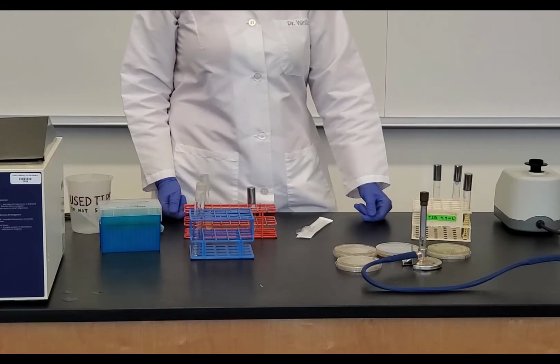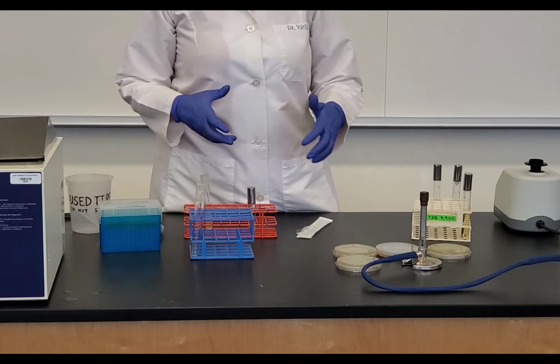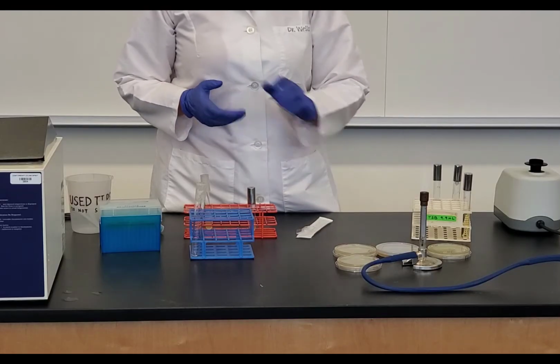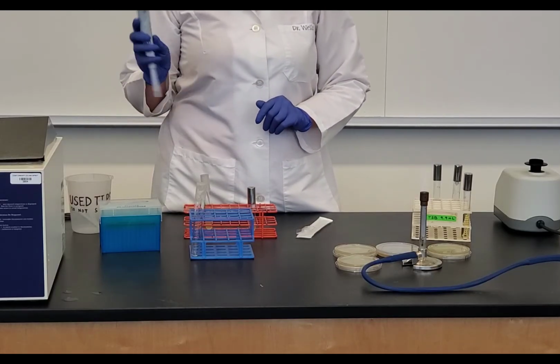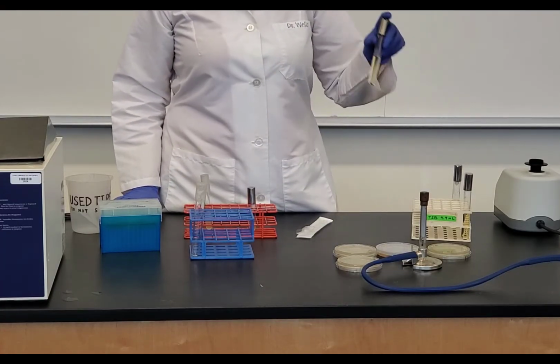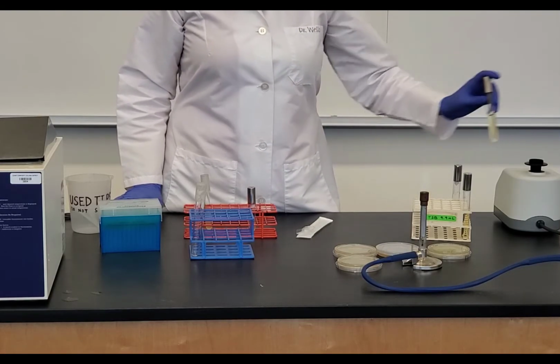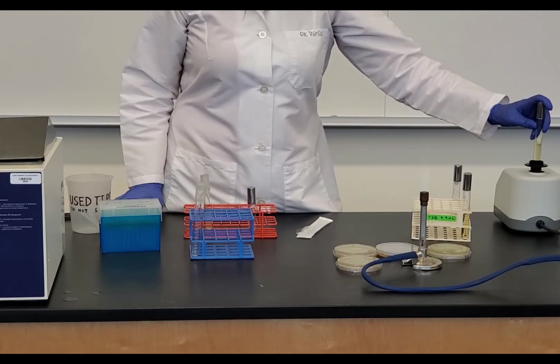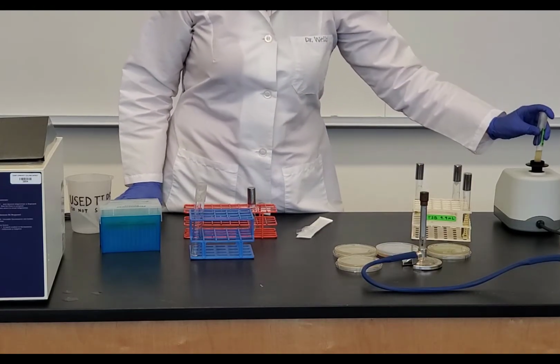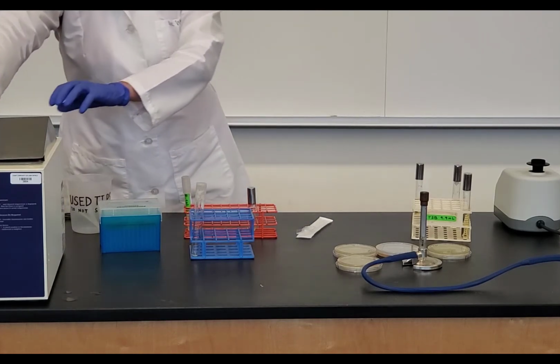Once I pour that plate, I want to make sure not to move it, because if I move it, the agar is going to slosh, and you're not going to end up with a nice even distribution of the E. coli with the phage. So once that's poured, I'm going to leave it. Again, I have my micropipetter set to 100 microliters. So I'm going to do my 10 to the negative 7. But this time, I'm going to draw from my 10 to the negative 6. So before I start, I'm going to vortex my 10 to the negative 6. I'm going to re-vortex my E. coli because I'm going to use that again. I'm going to get another melted agar deep.